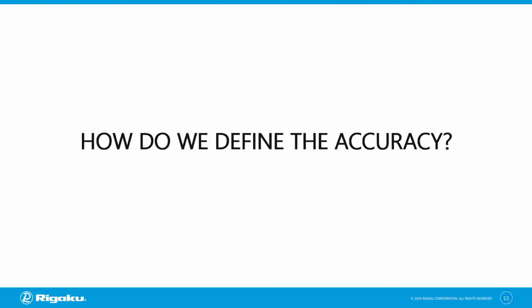How do we define the accuracy? This is an important question to ask ourselves if we're going to use this technique for process control or product design process. And there are several national and international standards available about X-ray CT accuracy evaluation.